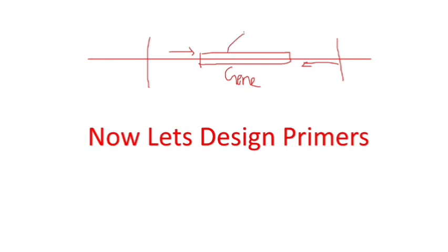Just for identification we can take the gene nucleotide sequence from GenBank, and you can paste it in Primer3, so that you will get your primer designed anywhere inside the gene.